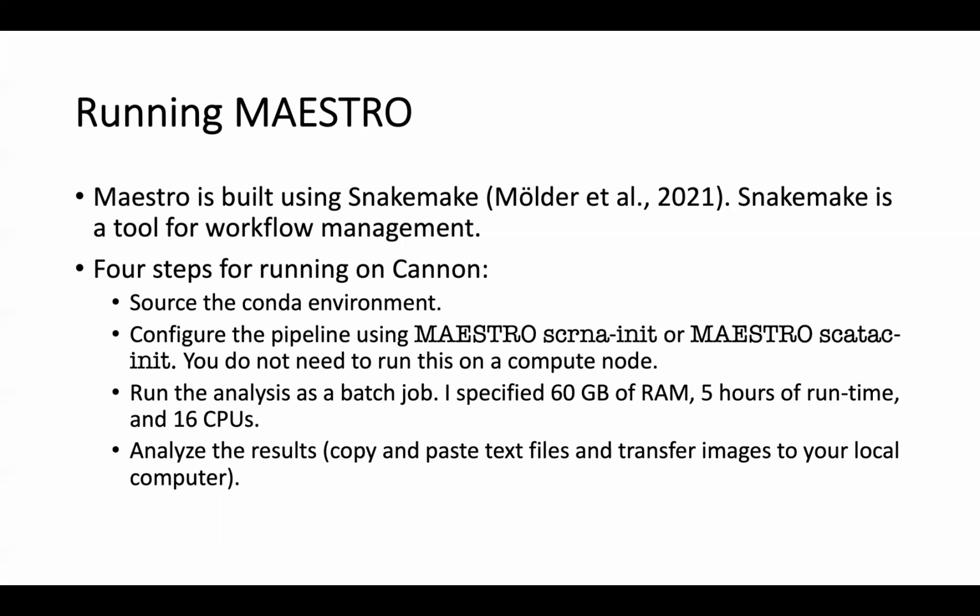Because there's a ton of things going on, there's a lot of potential for something to not work. But hopefully we can all get this run this week, because you definitely don't want to run this Sunday morning when the homework is due, because it does take many hours. So we'll try to get all these Maestro errors ironed out this week. Okay.